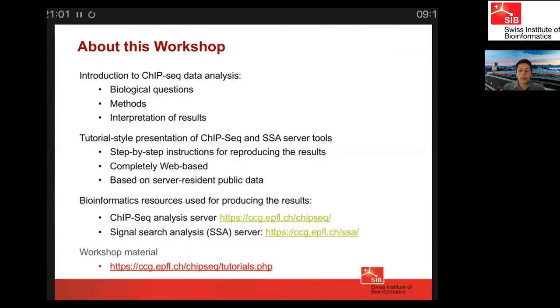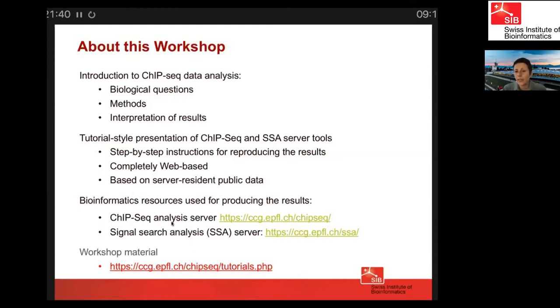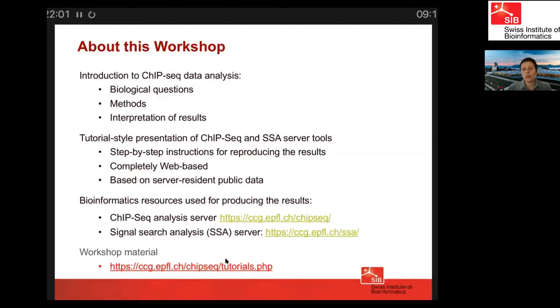About this workshop: I will focus on common biological questions for ChIP-seq data analysis. For each task, I'll try to expose the biological motivations, explain the underlying methods, and provide step-by-step instructions and guidelines for interpretation of results. We will work with two bioinformatic resources from our group — the ChIP-seq analysis server and the Signal Search Analysis platform for motif analysis. We also have additional workshop material available via the link shown here.